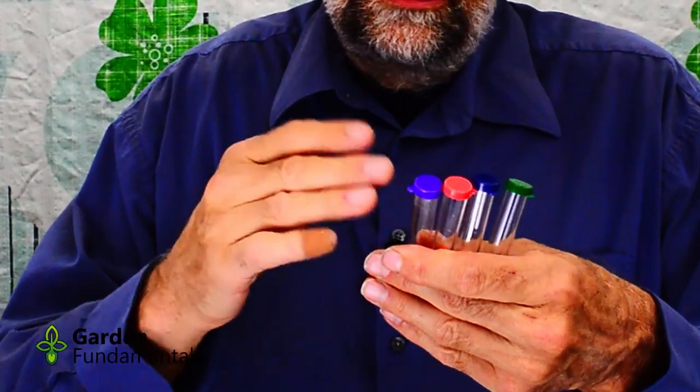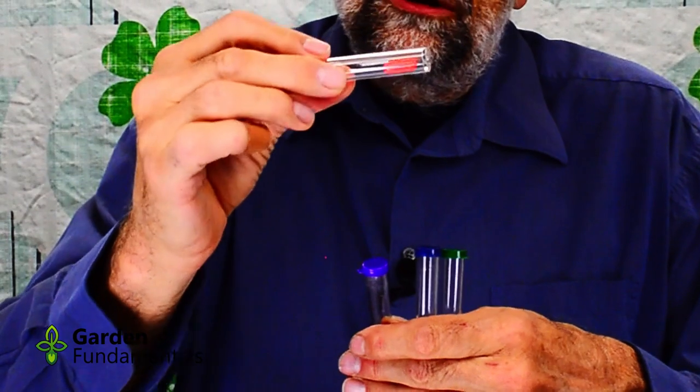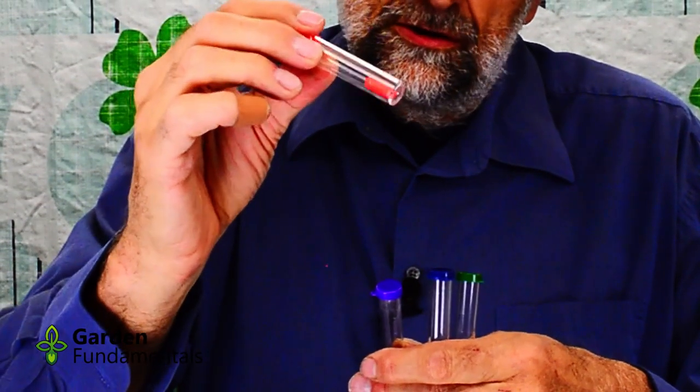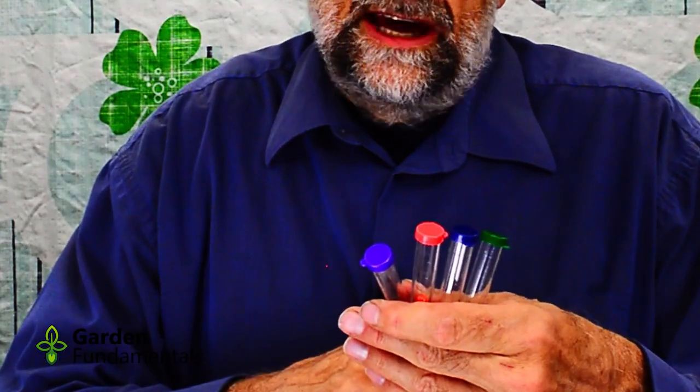Everything is color-coded, so it's easy to use. You have orange caps, and the chemicals are inside in little capsules, and they're color-coded — the orange chemicals go with the orange cap. So let's go ahead and do a test.